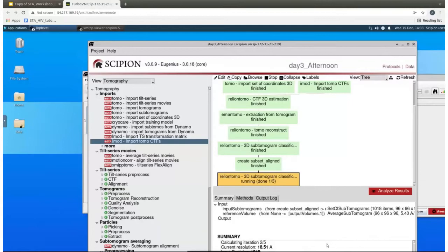No, I don't think, Bram, that the resolution in the summary is meaningful, because for the moment we did not perform all the standard steps or anything. So I think it is not really meaningful. So the how to refine, yes.